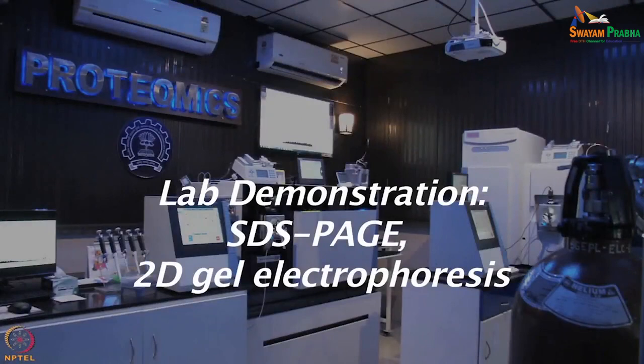So I hope you had a good view of the processes involved in performing 2D electrophoresis. You have seen there are multiple steps involved, which makes the process a little tedious, but if you have done everything meticulously, then you can see some beautiful spots separated on the gel, and those gel images reflect your hard work, your efforts in learning the protocol, the science, and all the steps involved in doing a good experiment.